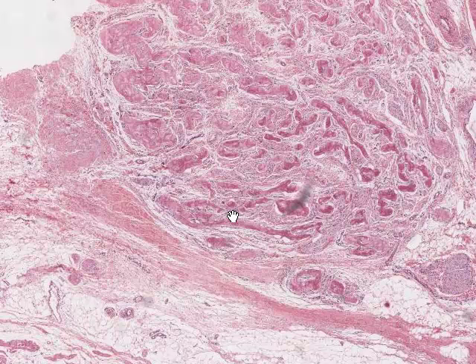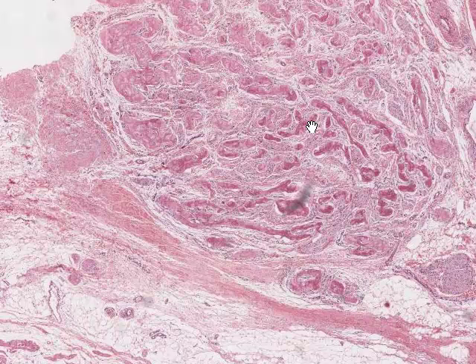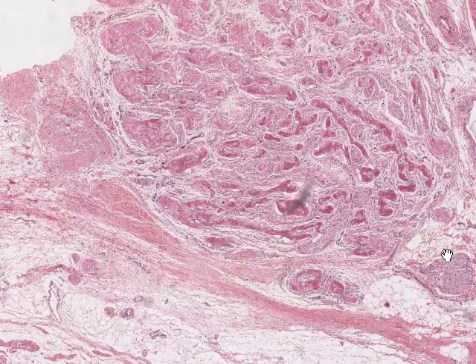Now let's look at the Purkinje fibers. This is a very large accumulation of Purkinje fibers — the bundle of His or the left or right bundle branch. Although Purkinje fibers are modified cardiomyocytes responsible for transmitting electrical impulses throughout the heart, the contraction of the heart and the regulation of these electrical impulses is influenced by the autonomic nervous system. So we would expect to find, and indeed we'll see, many small bundles of peripheral nerve in and amongst these Purkinje fibers — in fact, there's one right here. We would also expect this to be quite a vascular region, and indeed here's an arteriole and there are other blood vessels we'll encounter.